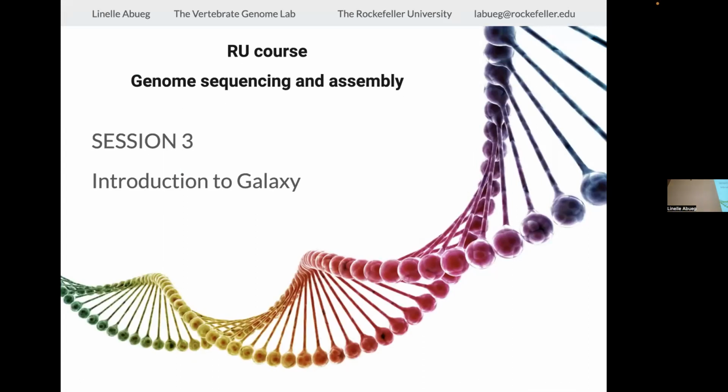Any questions? I'm going to pass the one. This is Bionano. That's what it looks like, so as 3 full cells, and you don't see the nanochannels. I'm going to check the chat. Okay, I'm going to quickly just turn this. Oh, no, there is one. Get them before I have to show one of the chips.